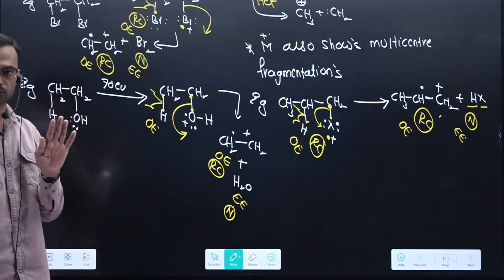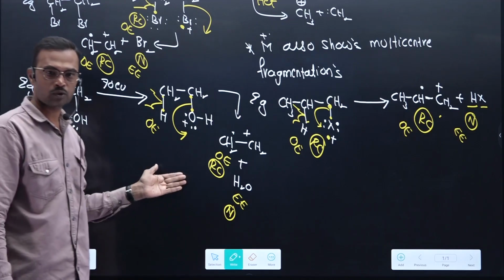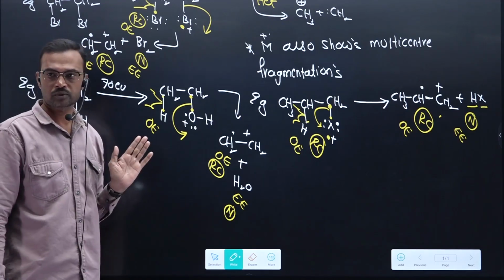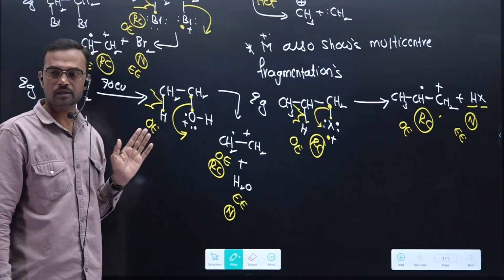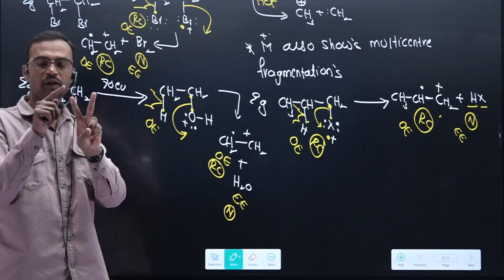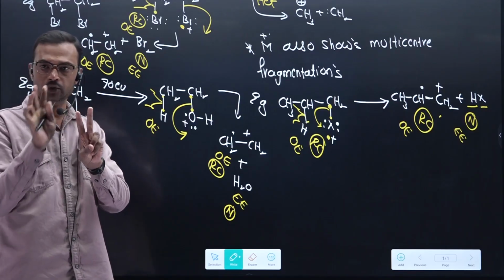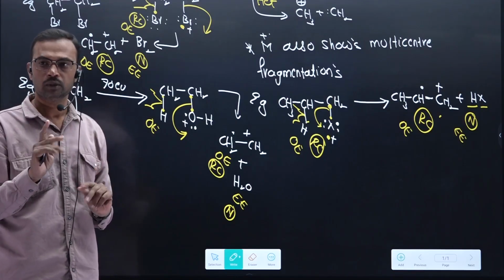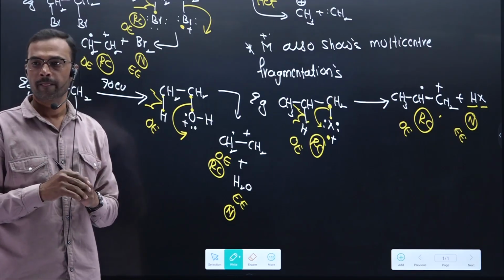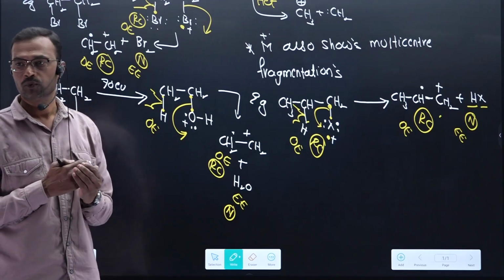Something you understood, I think so. Slowly we are entering into the core knowledge in mass spectrometry. If you know the rules, there is no need to learn functional groups. Directly you can attempt the examples and work them out. Remember two rules: the even electron rule and the odd electron rule. Right now I have given only one example for the odd electron rule. What is the odd electron rule saying? What is the meaning of the odd electron rule?